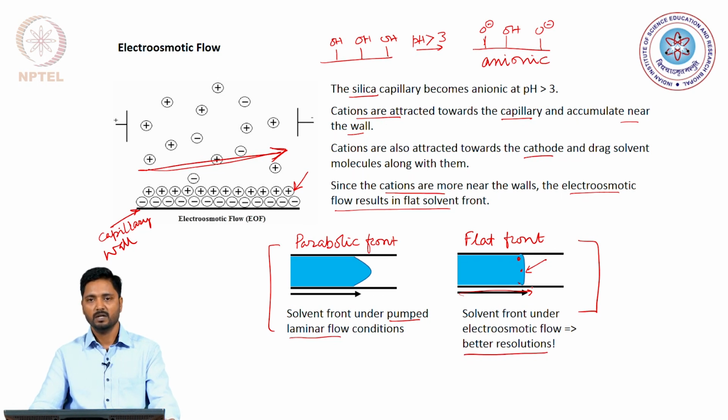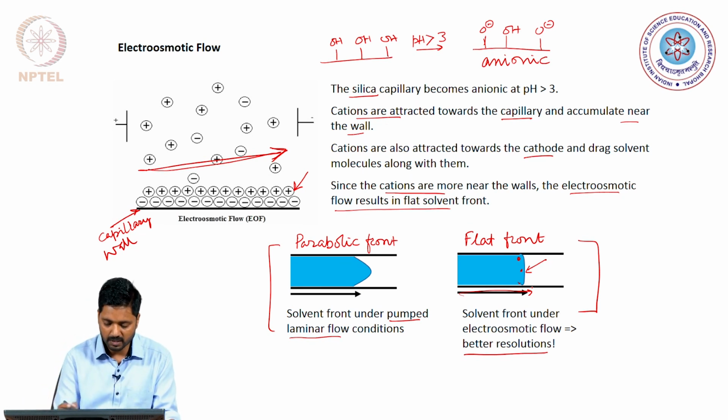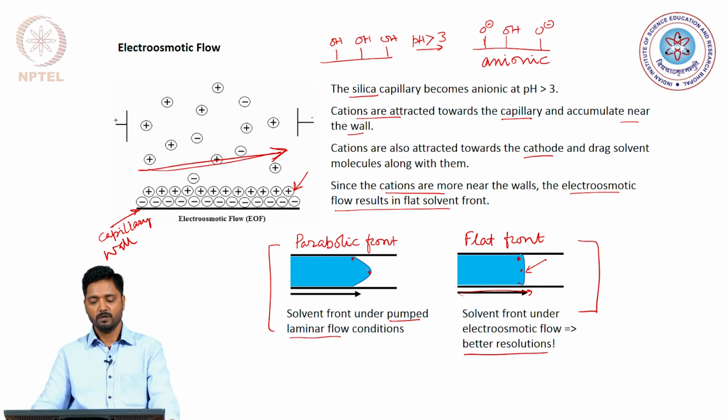This is in clear contrast with the flow that happens under the pumped conditions, for example, in our typical liquid chromatography separations, where a particle near the surface is lagging behind a particle which is more at the center of the flow.